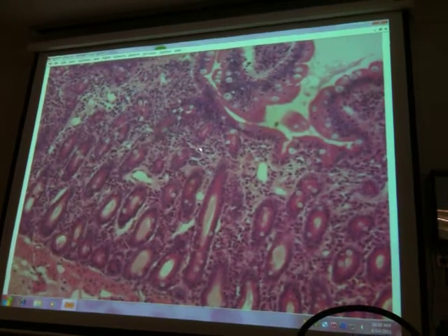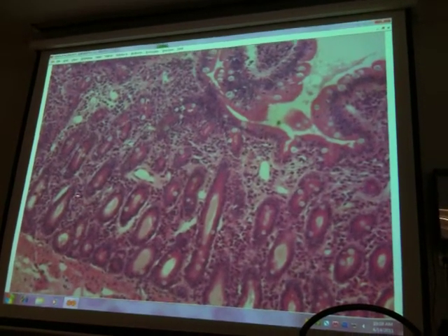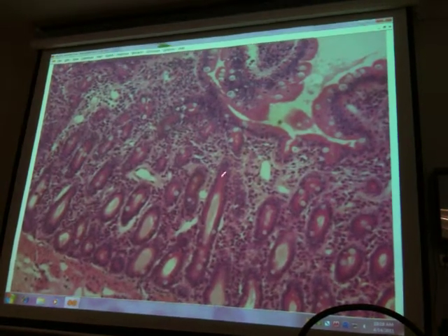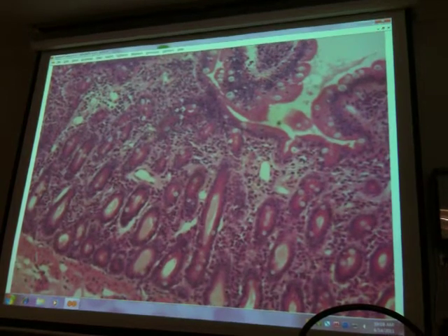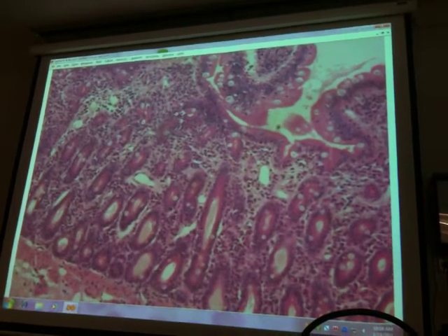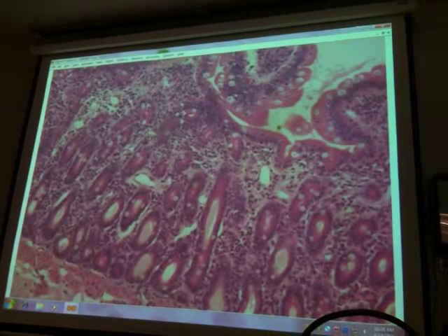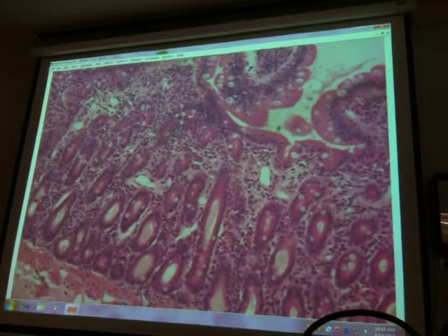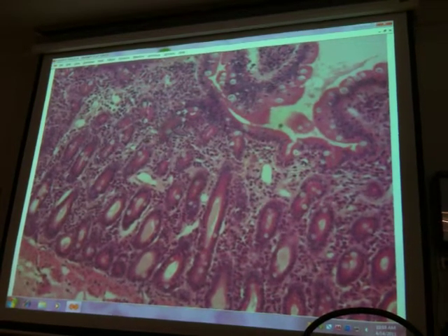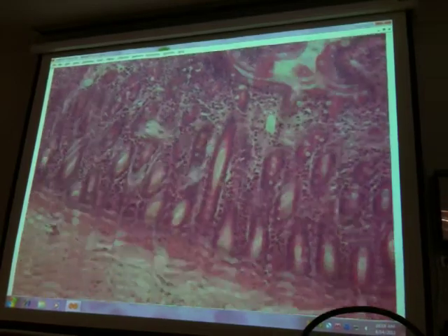So the sublayer here is the lamina propria. But contained within the lamina propria are these intestinal crypts. Okay? And here they're producing an intestinal juice, which has enzymes to digest all food categories. So this is a supplement to the pancreatic juice, and it's not sufficient for full digestion and nutrition of the organism.